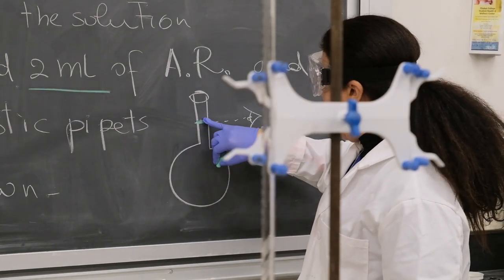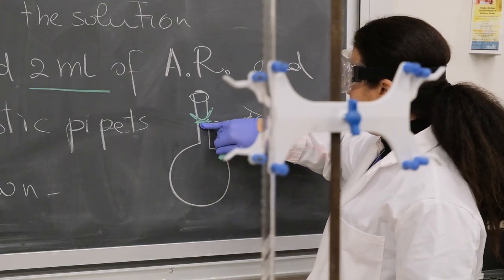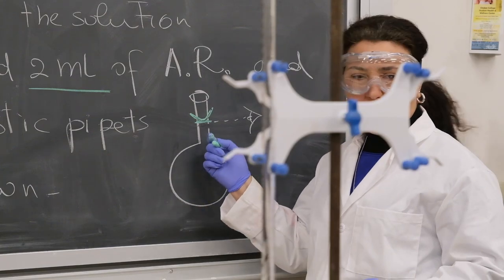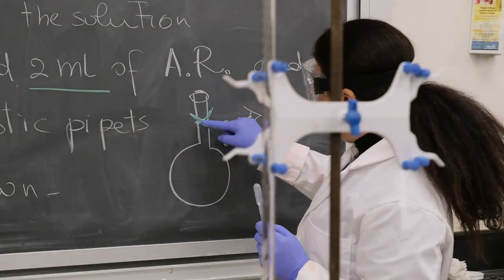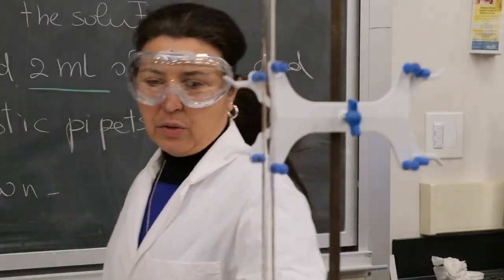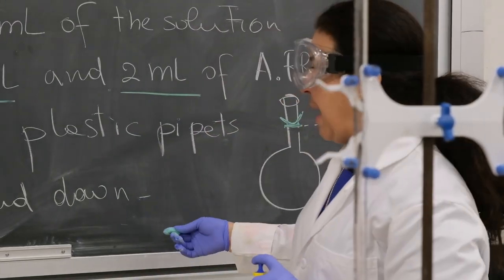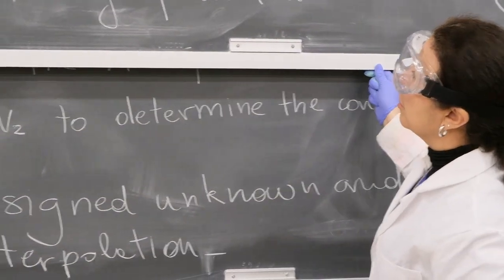We point our eye to the meniscus, to the line, and we have to have the bottom part of the meniscus of our solution touching the line. Remember, in order to do this, we're going to use plastic pipettes so that we add the last few drops to reach the line in a very accurate way. Once the solutions are ready, you're going to mix them, tilting them up and down about 10 times, so that the solution is homogeneous and has the same concentration throughout.